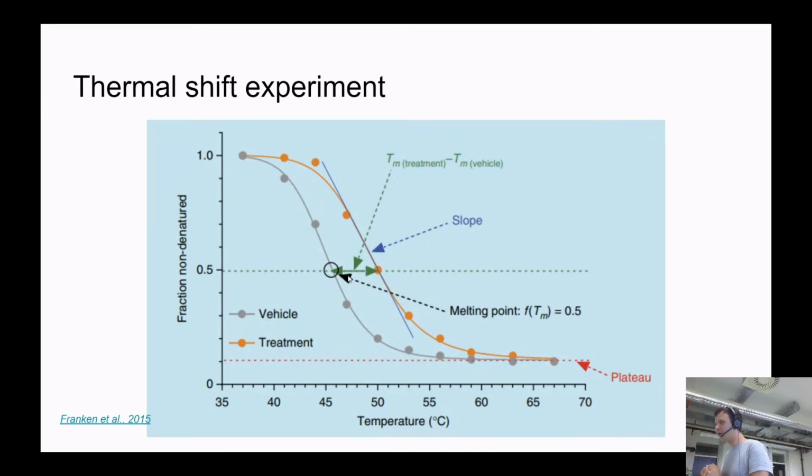What's really cool is that we can do this for 10,000 proteins simultaneously. We can measure how the thermostability of 10,000 proteins changed. And the truth is, if a drug attaches to certain proteins, then this protein usually becomes more thermostable. The reason is that this drug brings some connections, some bonds. It can be hydrophobic, whatever bonds.